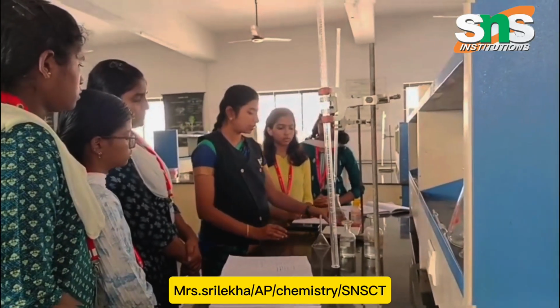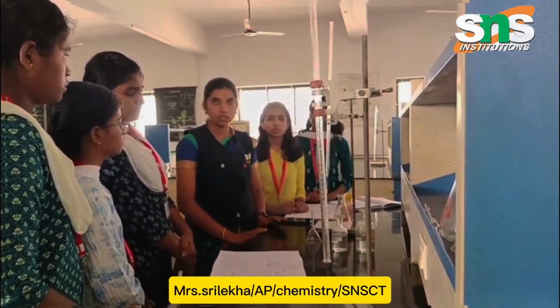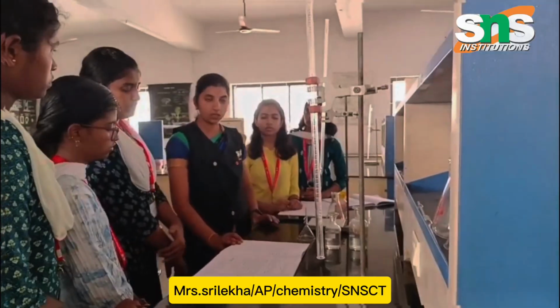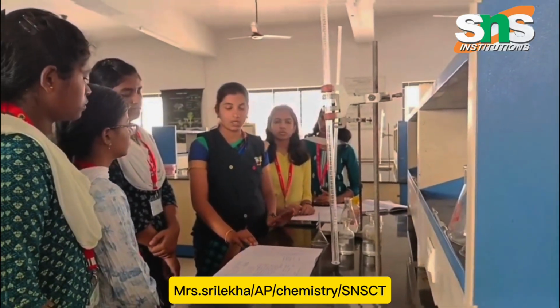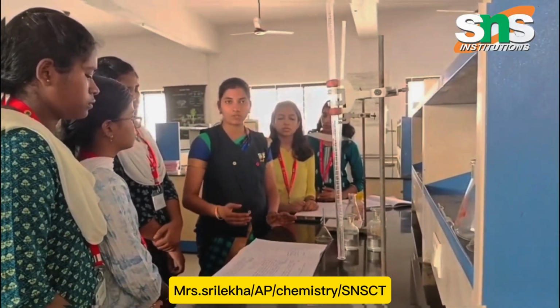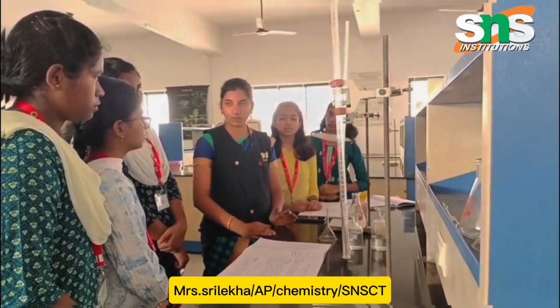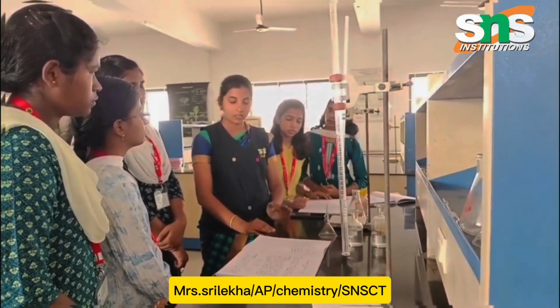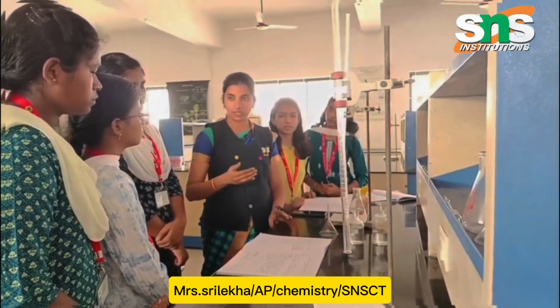Okay, with these two readings, we have formulas to substitute into. The first formula is P equal to 0 for phenolphthalein. When P equals 0, the hydroxide OH group comes as 0 value. When P is equal to M, the readings give M as a greater value.